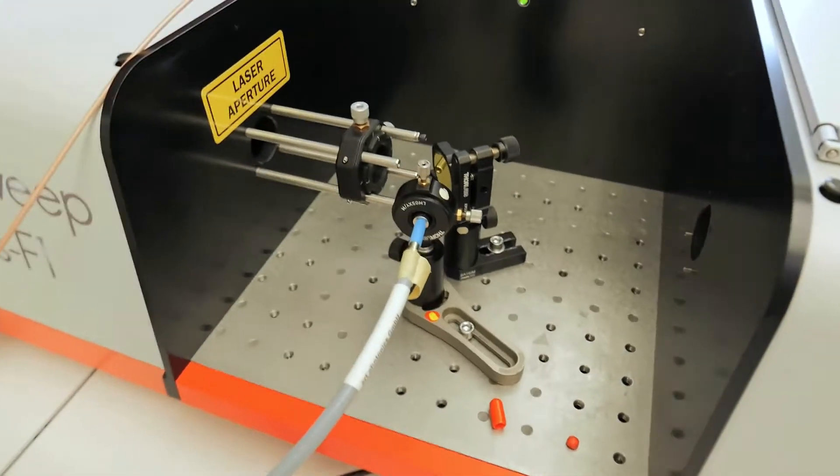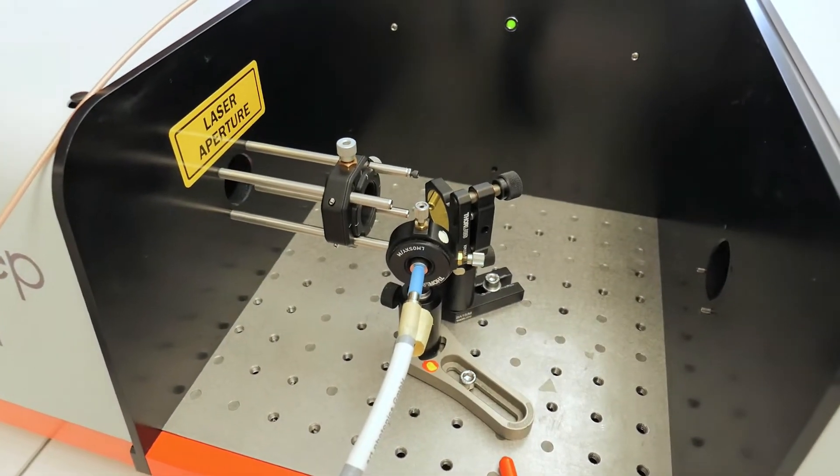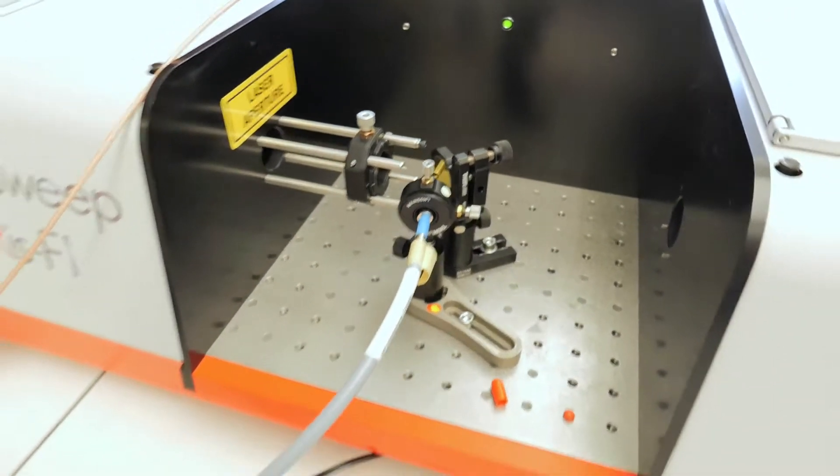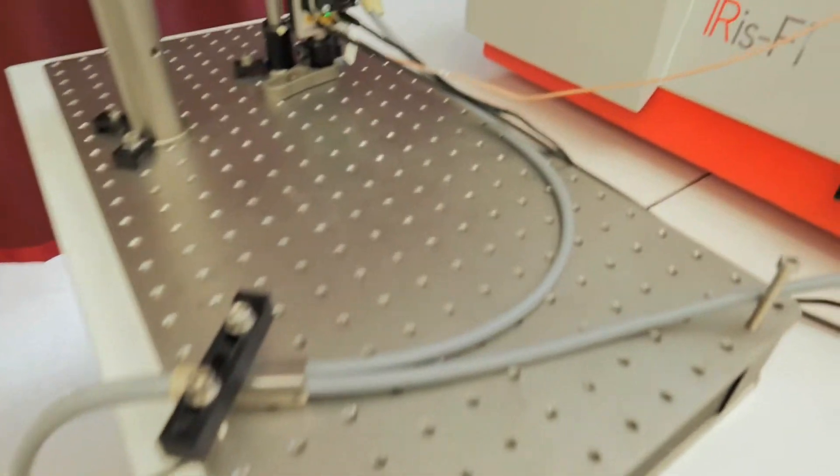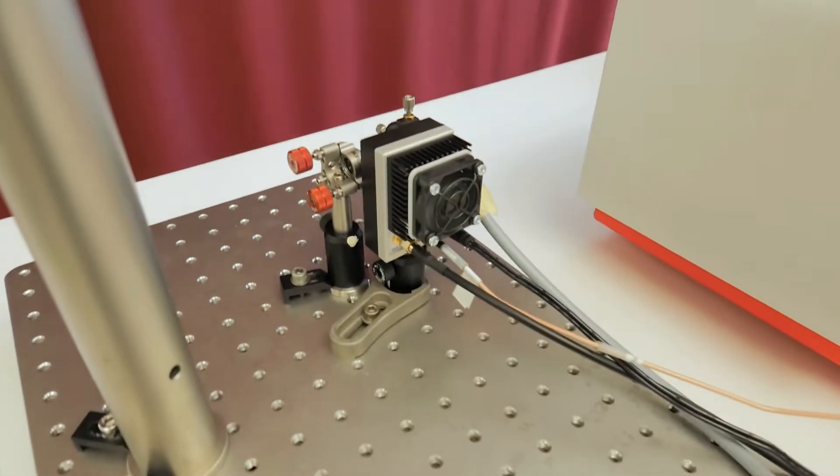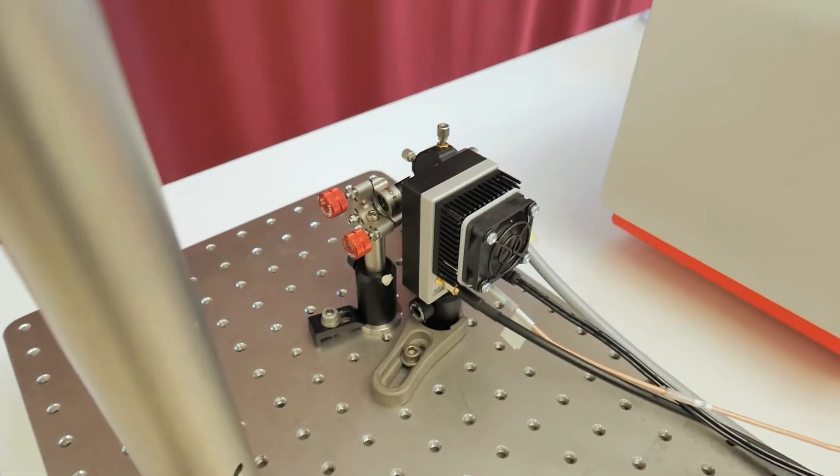So here's an in-coupling setup where we have a lens and a mirror, so rather simple. Then the fiber disappears off into the distance and it comes back to an external detector where we have an out-coupling setup.